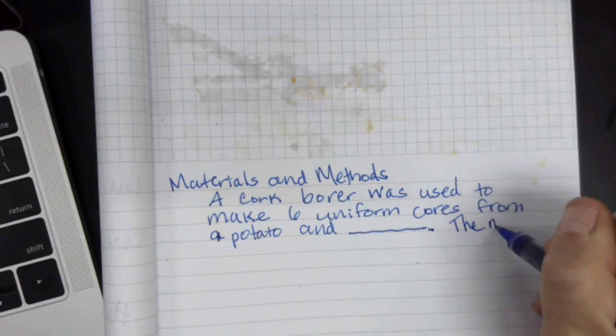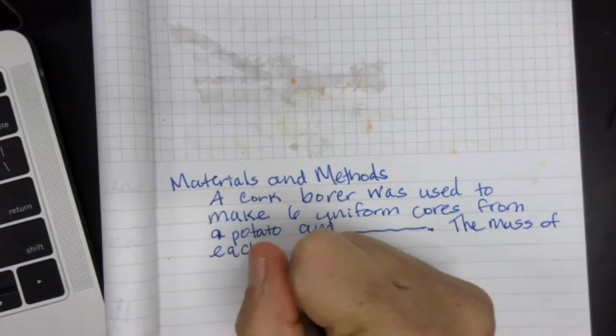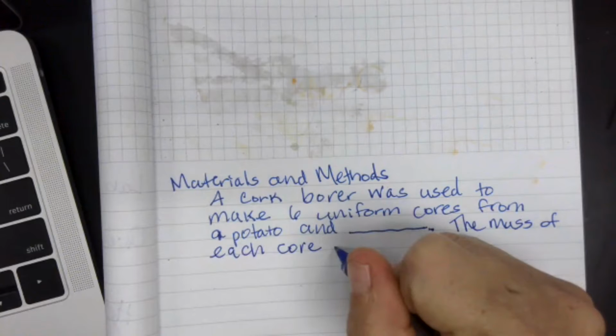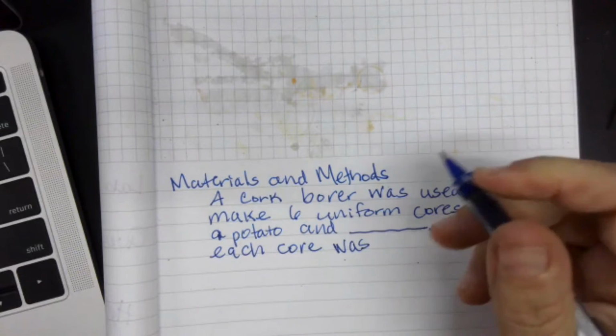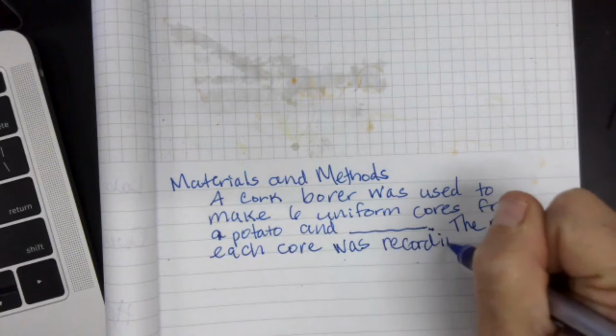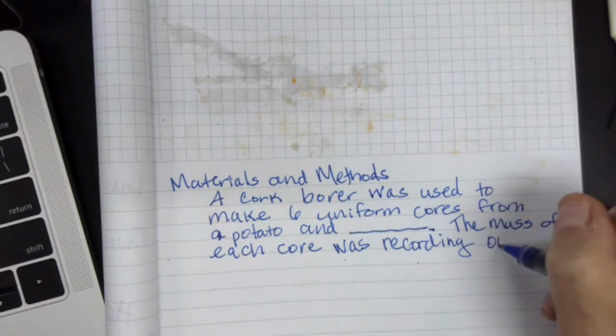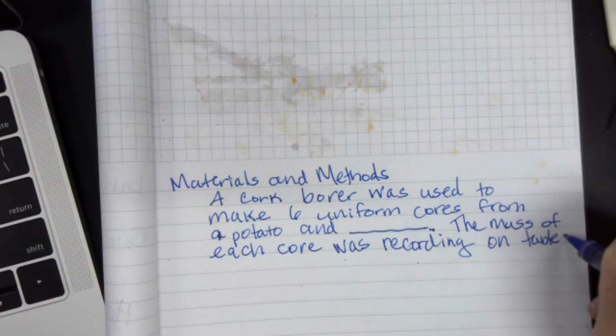The mass of each core was recorded. Because we're recording it, I don't think we need to say we take it. Obviously we're going to record it on table 1.